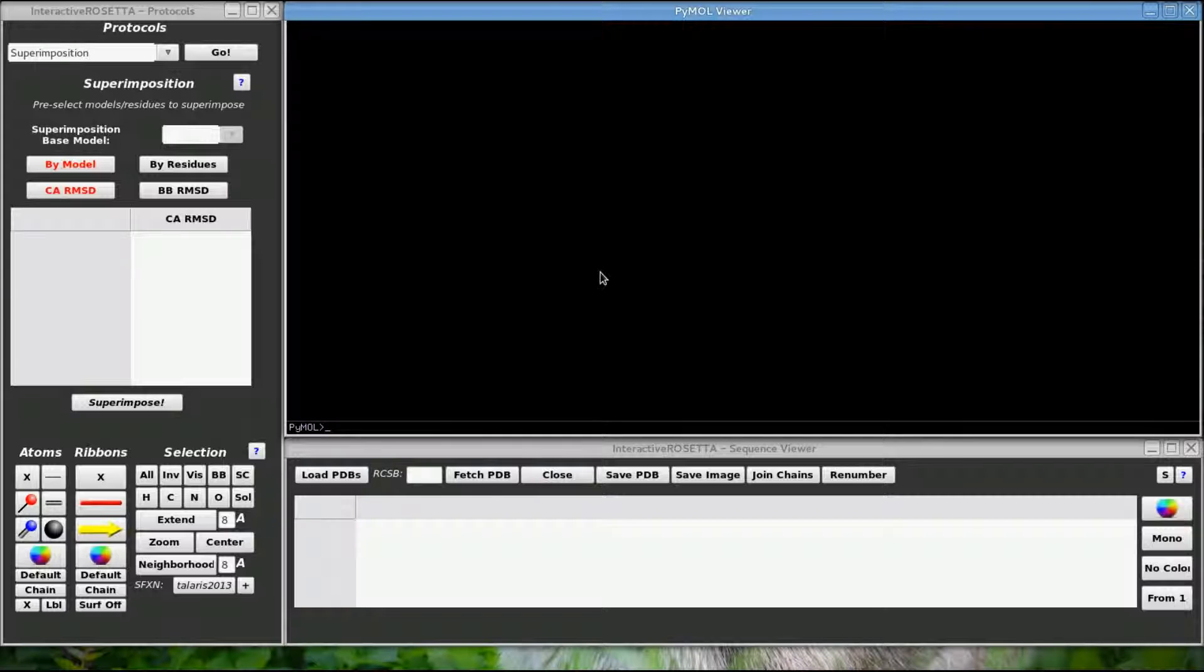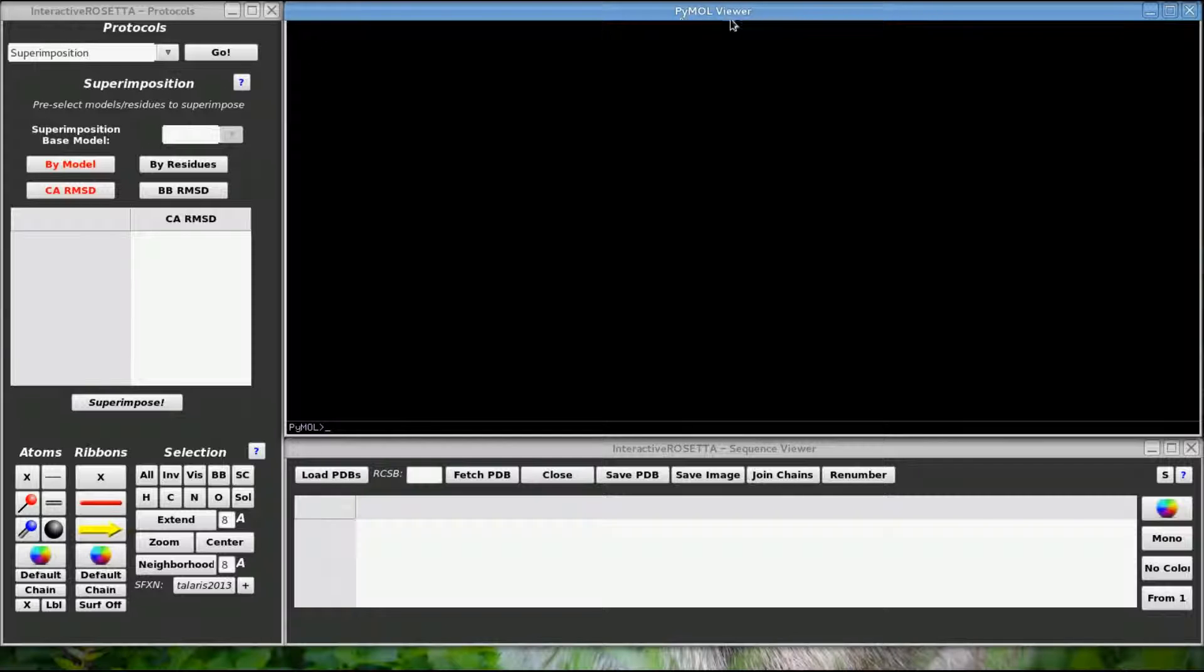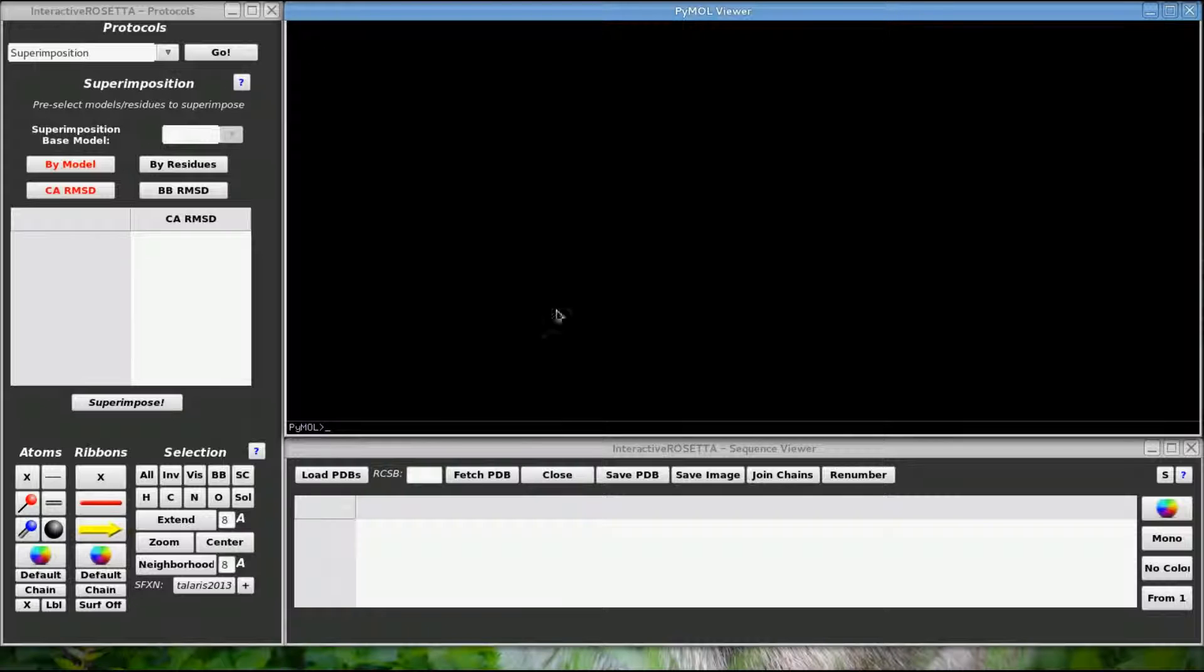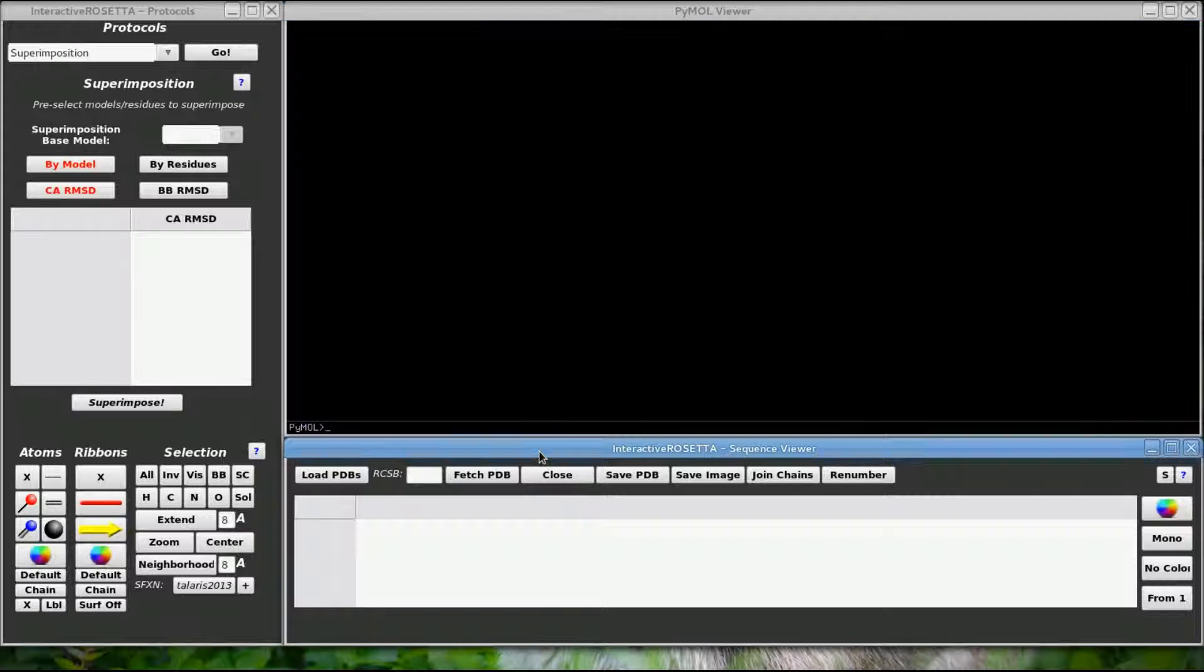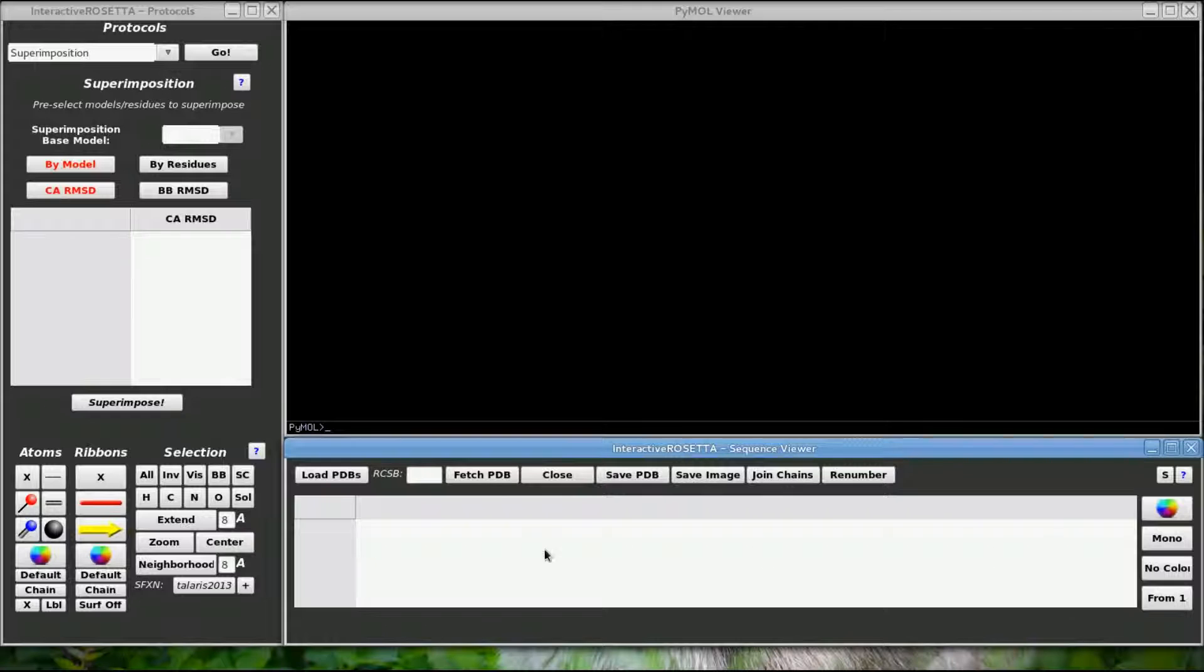First I should explain what these windows are. This black window up here is a Pymol window. It is the open source version of Pymol that is being used here. If you are familiar with Pymol already, this window does everything that a normal Pymol window would do. This lower window is known as the Sequence Viewer and will display the primary sequences of all the structures loaded in Pymol.